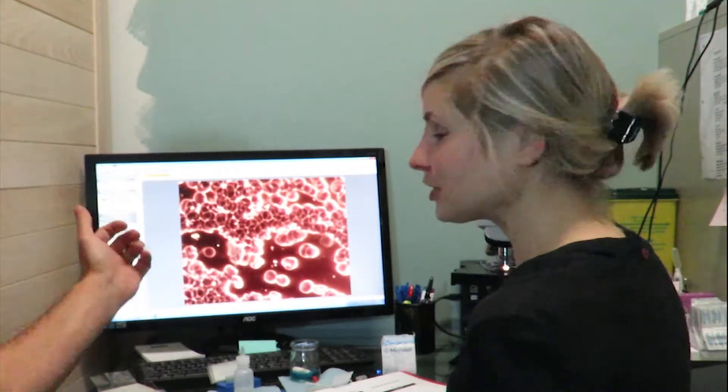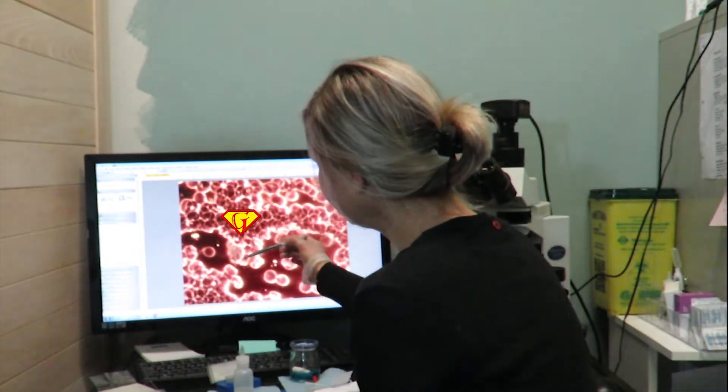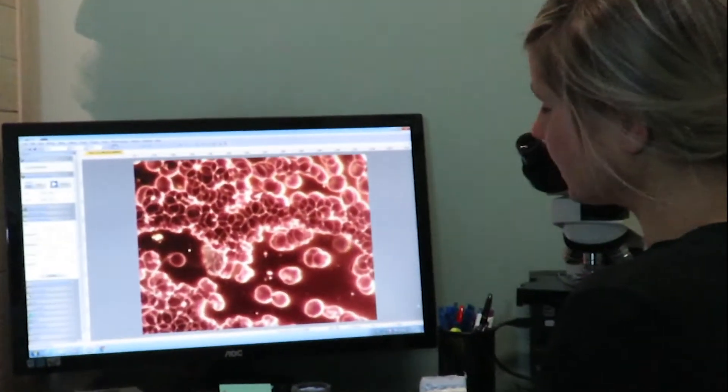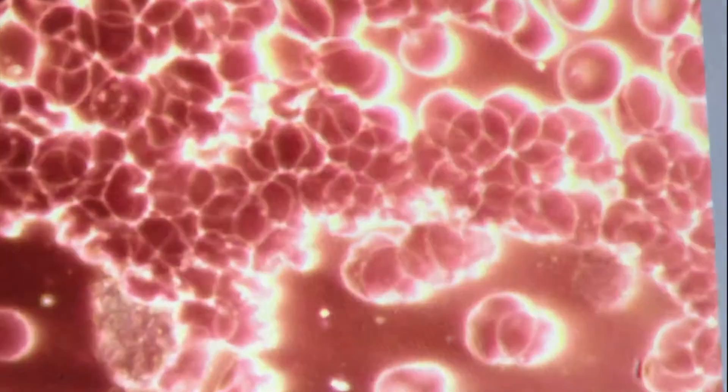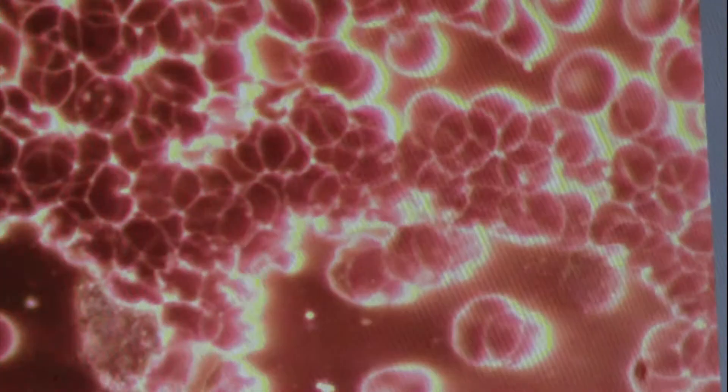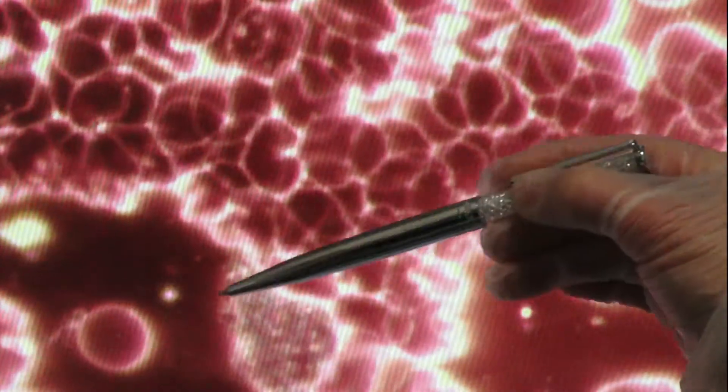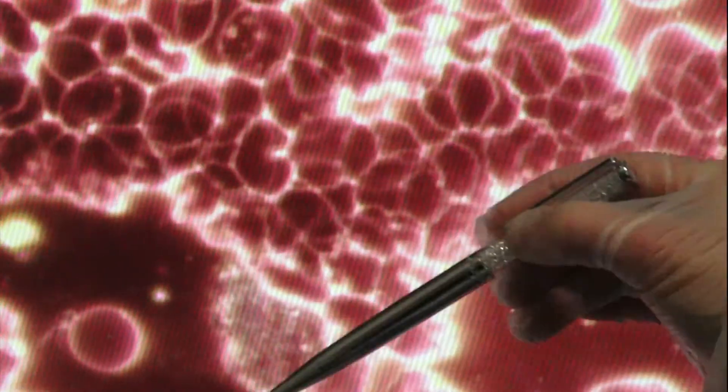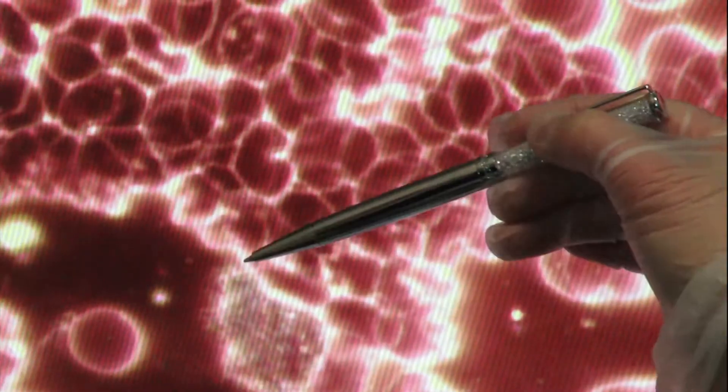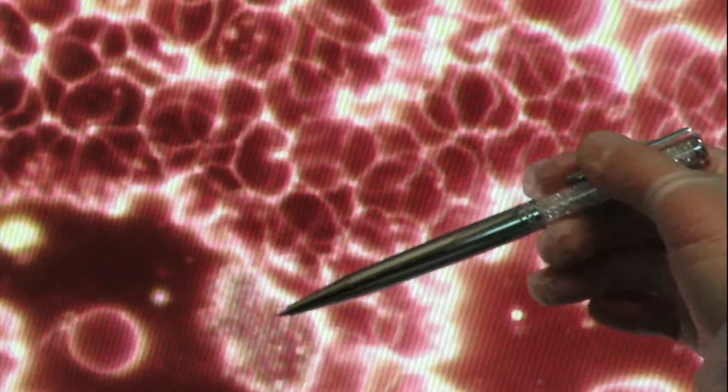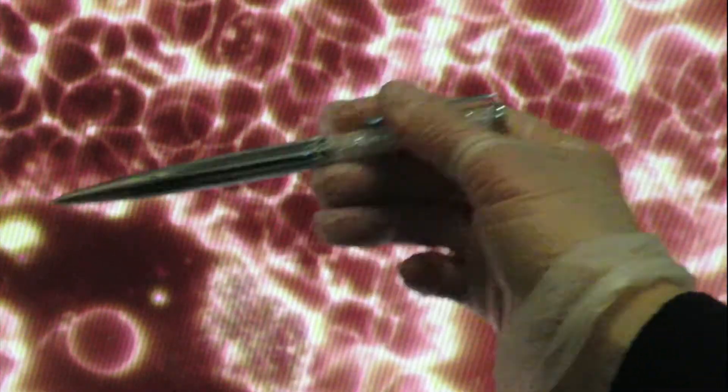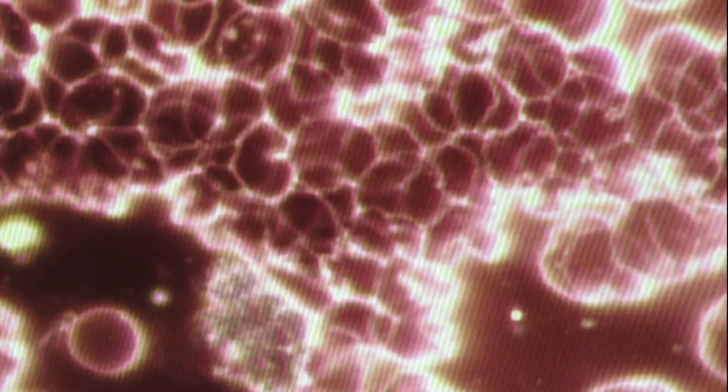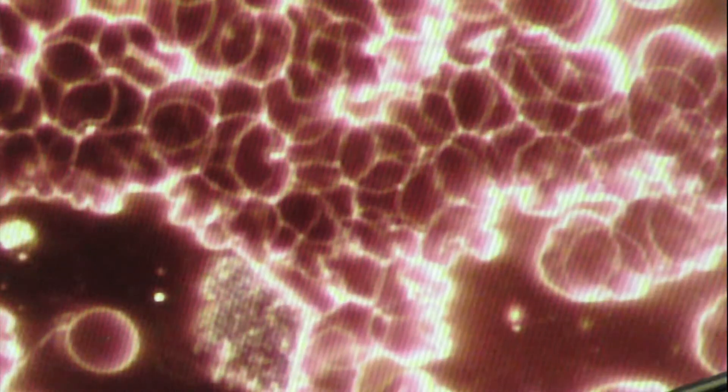That looks like a star. This is your superhero. Let me see that one. Go nice and close on that guy. So he's lovely. Where is he again? He's right here. Point him. So this is our superhero. It's the white blood cell and he's beautiful. The job of the white blood cell is to clean up all the debris that he sees in the plasma. Like these little bits of yeast here that you're clearing. This bright thing here that looks like a star, like it looks like a solar. If I focus on that, these are little bits of yeast going on in here.